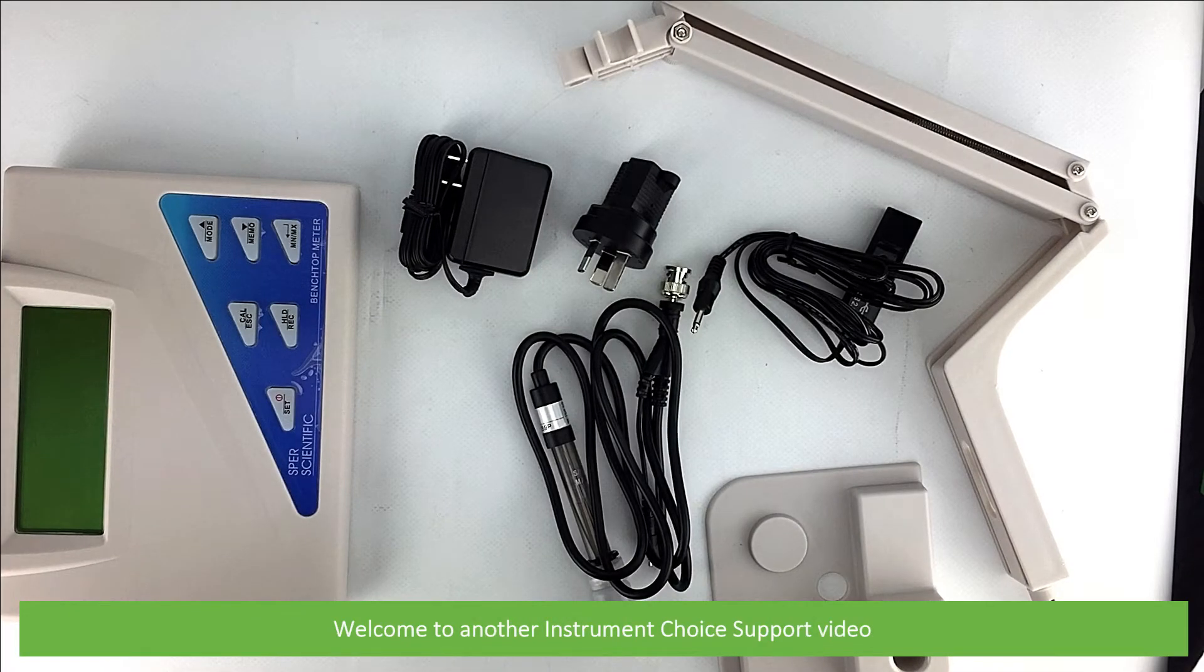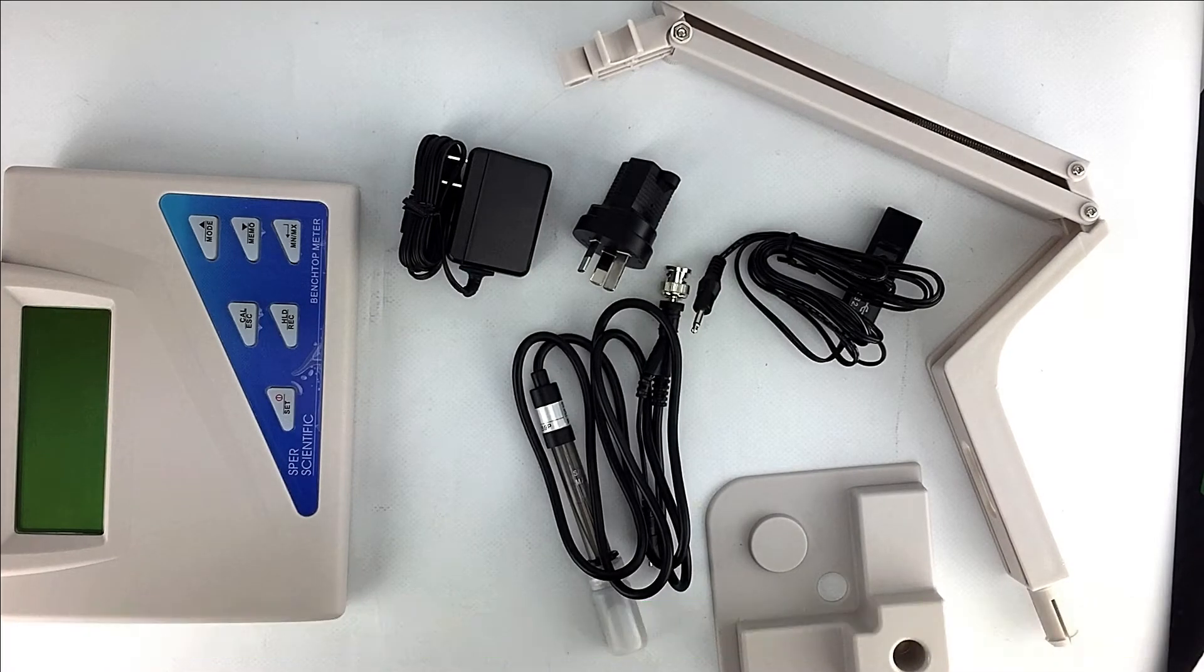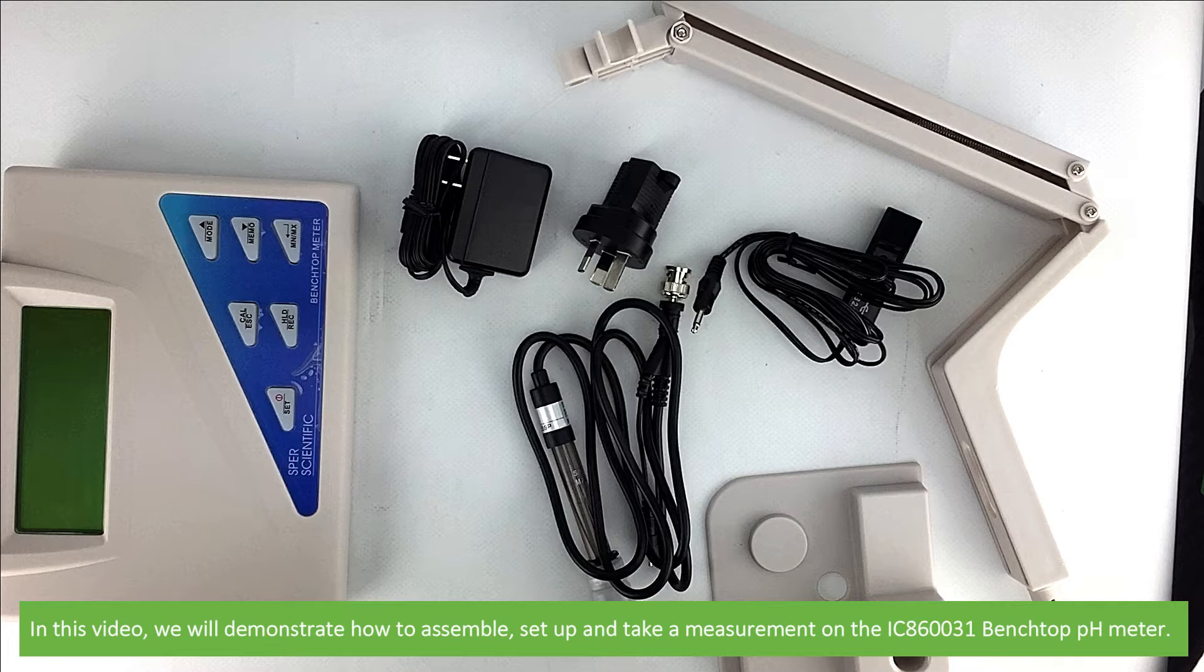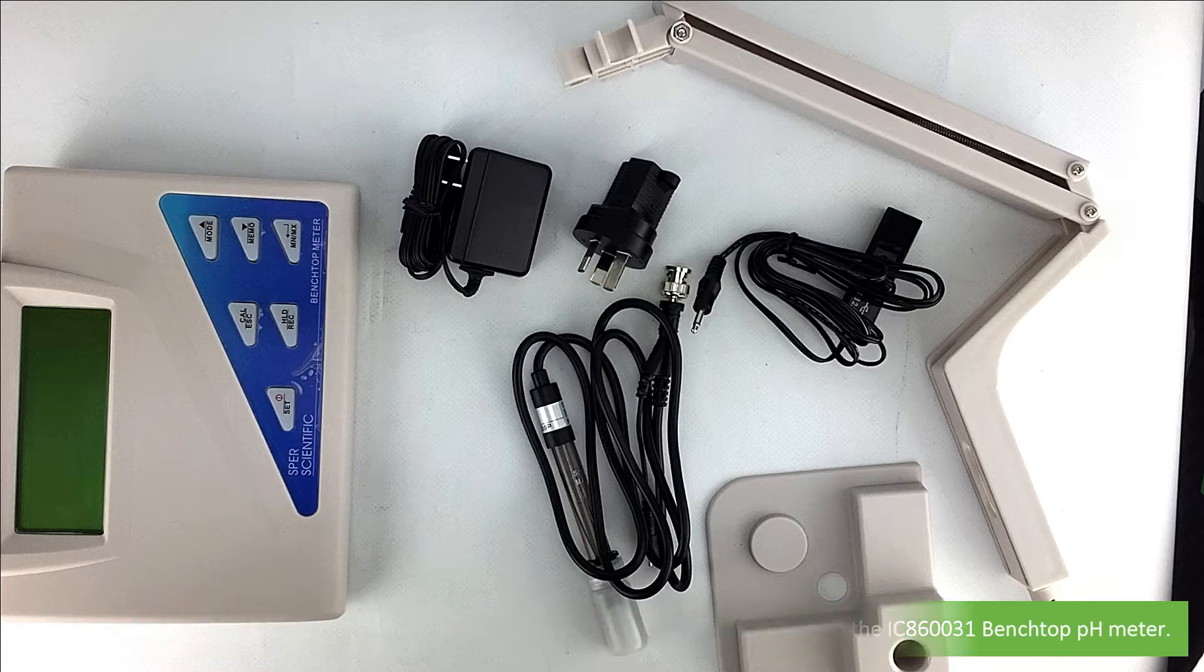Hi and welcome to another Instrument Choice support video. In this video we'll demonstrate how to assemble, set up and take a measurement on the IC860031 benchtop pH meter.